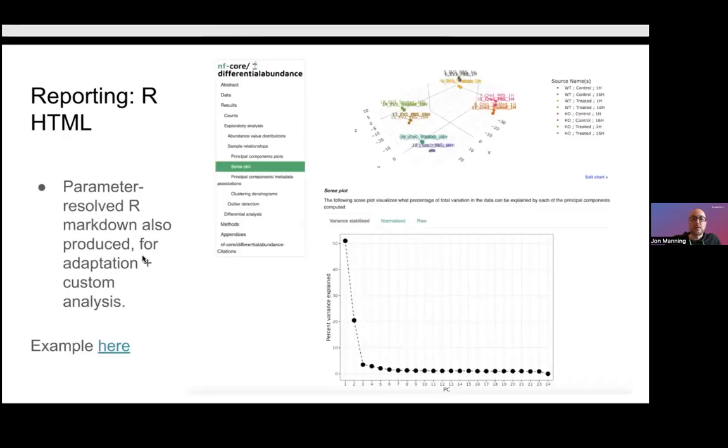One of the reporting outputs of the workflow is a HTML report derived from an R markdown file. Importantly, we also provide the R markdown file itself with all the parameters resolved at the end of the workflow, and that allows someone to take that markdown file and the results files that are bundled with it and customize it to do their own type of analysis or to tweak the plots, which can be quite a powerful thing to be able to do, because obviously we can't anticipate all the things that people might want to do in their reporting.